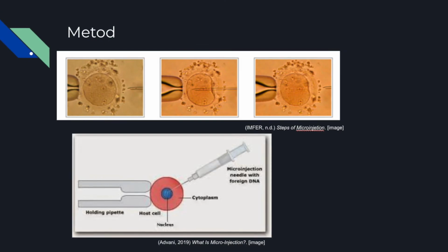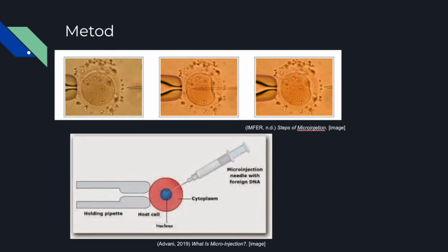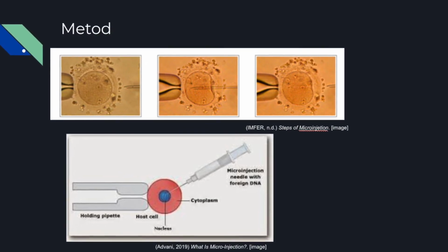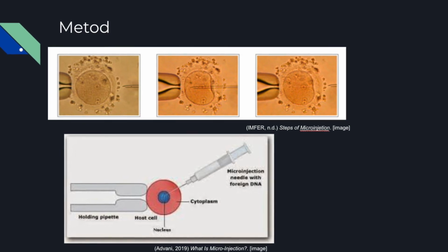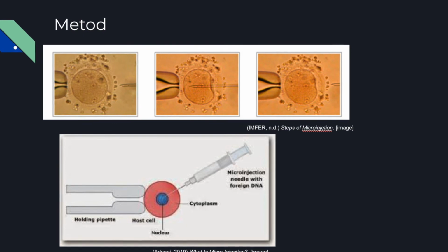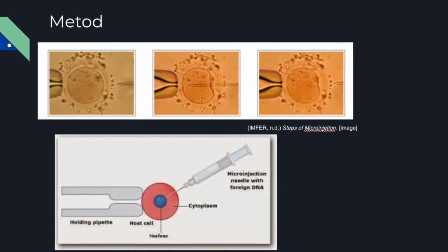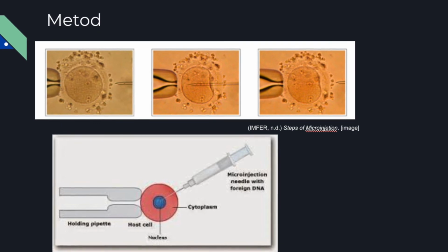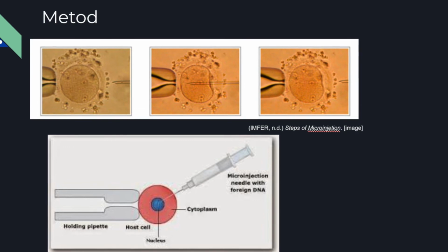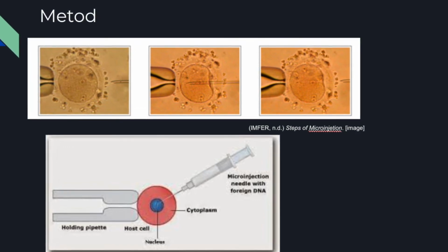The injections are made with microneedles with an external diameter of 1.0 mm and an internal diameter of 0.78 mm. The cells can be injected under pressure using a microinjector and micromanipulator. A microinjection microscope is used to visualize the cells. The recommended injection pressure is 79 mm of mercury, and the recommended compensation pressure is 50 mm of mercury.